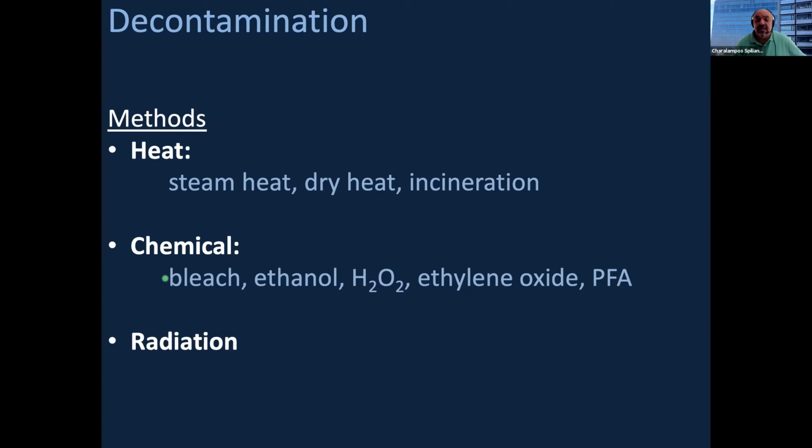Chemicals such as bleach, ethanol, hydrogen peroxide, ethylene oxide, or paraformaldehyde could be used in order to kill microorganisms, and also radiation.